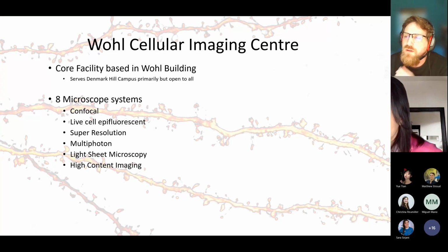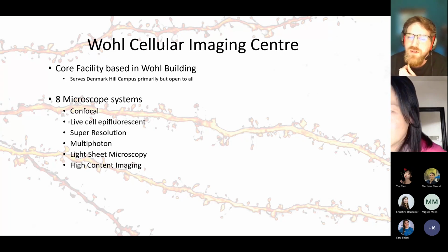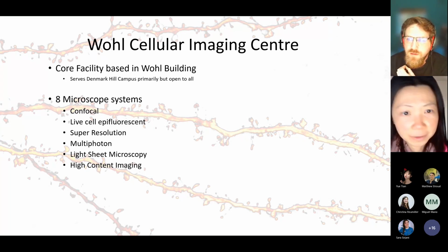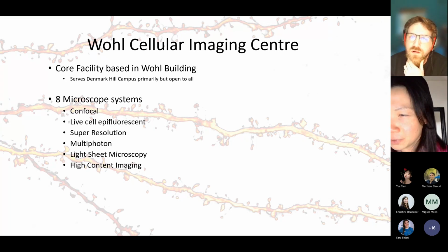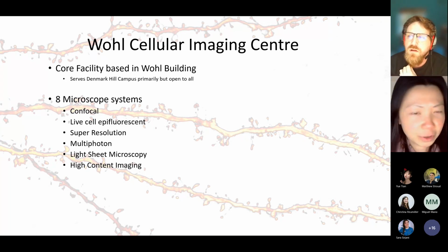Sorry. Sure. So this is about storm imaging. The storm imaging processing looks like it produces really large data files. Does that affect the development or download time? I presume this refers to the images that have been captured.